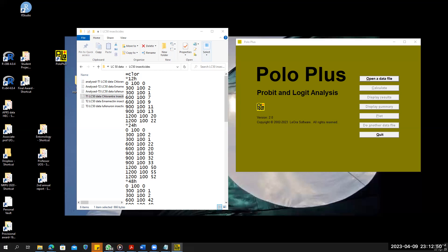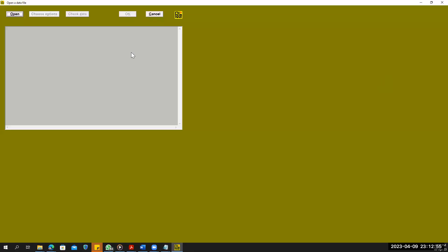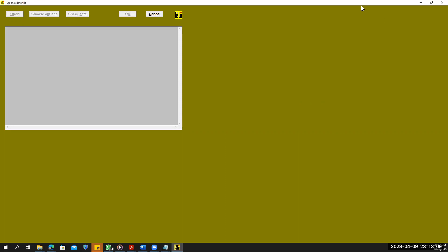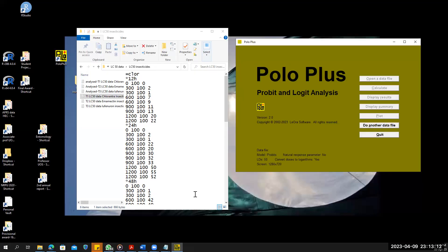Open data — navigate to the location where you have saved the file. How do you save the file? How do you enter the data? This is very important, so I will let you know how to enter the data.